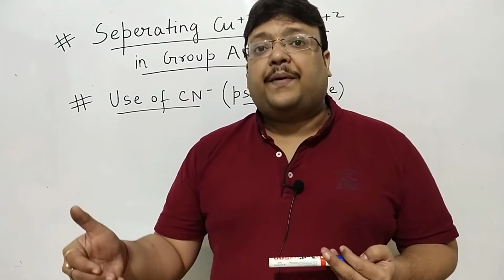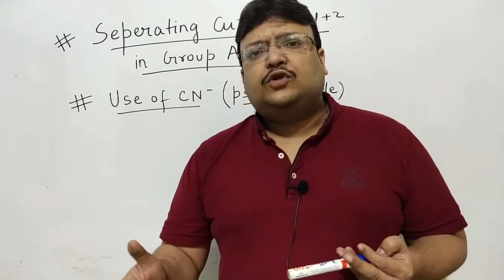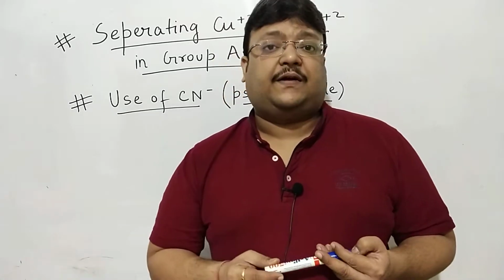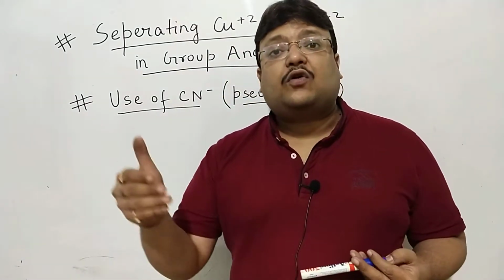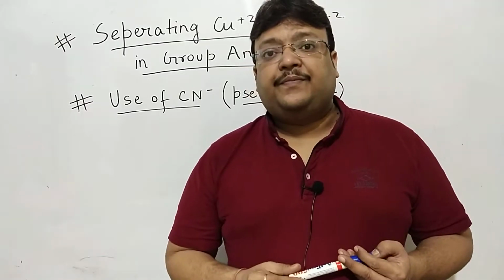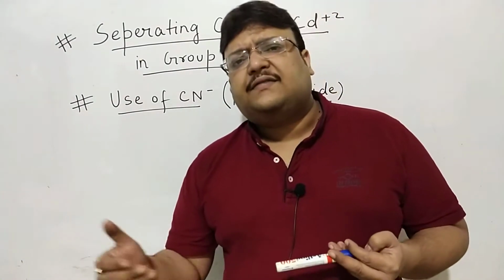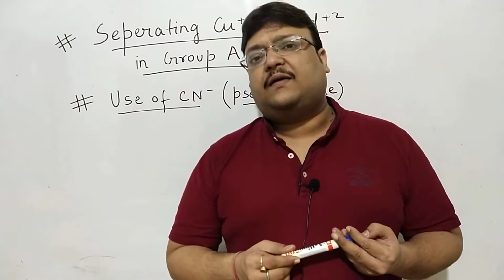Soluble were lead, copper, cadmium, bismuth, and then you add sulfuric acid. Before testing lead, sulfuric acid precipitates lead sulfate, and then you can dissolve it and do the confirmatory test. If it doesn't precipitate, it is copper, cadmium, bismuth. Then you add ammonium hydroxide, and the only precipitate is bismuth hydroxide. Copper and cadmium both become soluble. Copper gives you a blue colored solution, cadmium gives you a colorless clear solution. We did speak about that.